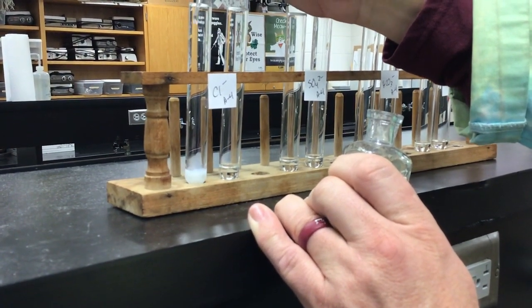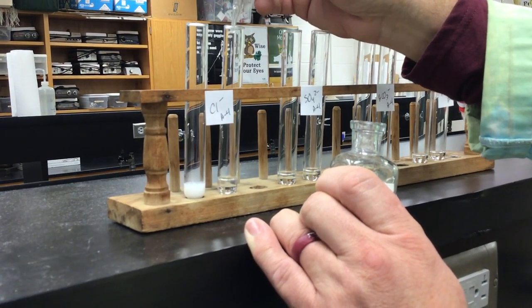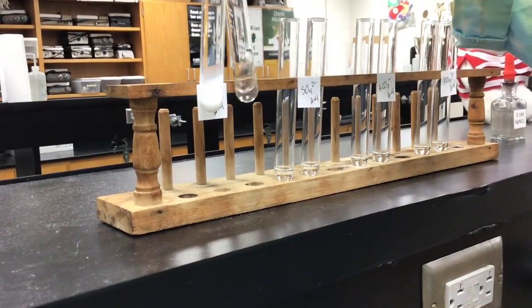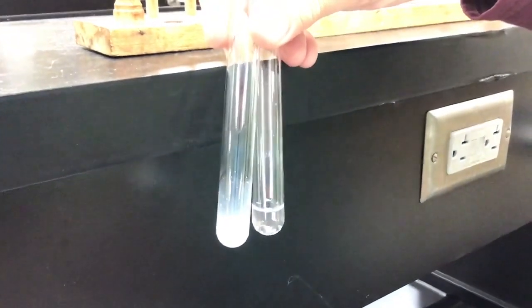So I'll add it here to your unknown. And see what you see. I'll even give them a little tap, little flick. See if you see anything there. I think we can move on.